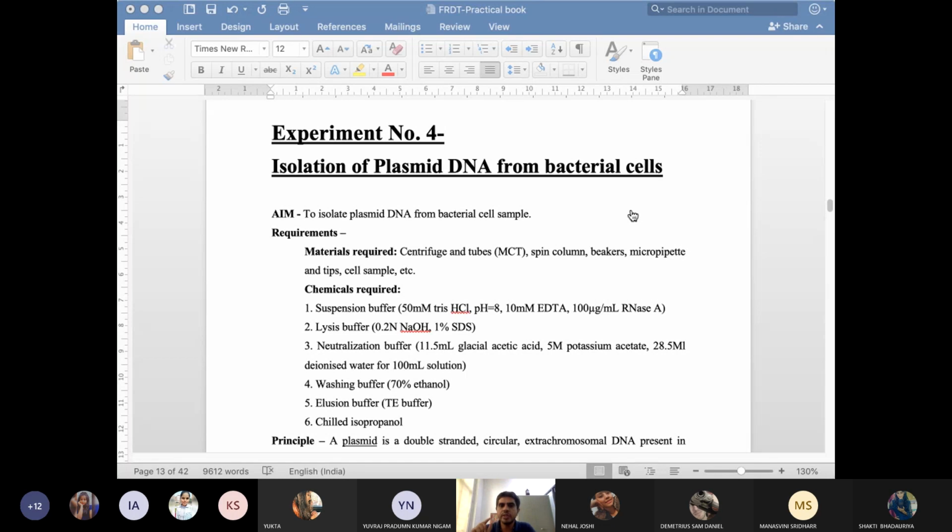So now I want to introduce you to this OH, the alkaline one. This alkaline OH is also going to interfere with this hydrogen bond because it is going to contribute your O, that is going to be a negative one, and H, that may be a positive one.